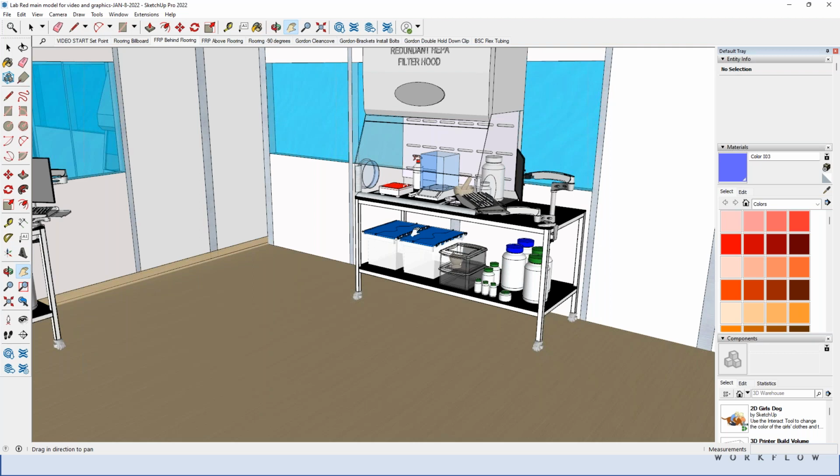If somebody says, hey, what does your workstation look like? Well, this is my perfect workstation. I've got weigh boats, straws, other things happening in here, maybe in here, or clean dishes. And I've got all my APIs. I'm doing all my capsules here. When I have to do that DDCD process, this is going to be the easiest thing for me to clean. I pull these totes out, I wipe it, I DDCD it, deactivate, decontaminate, clean, disinfect, and then I'm moving on about my business.